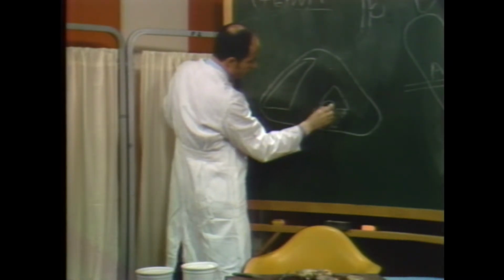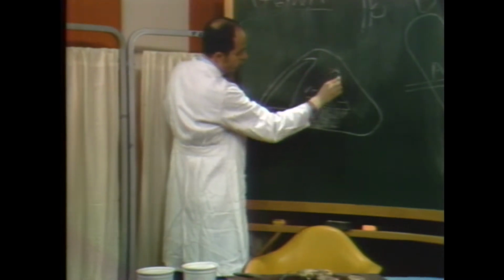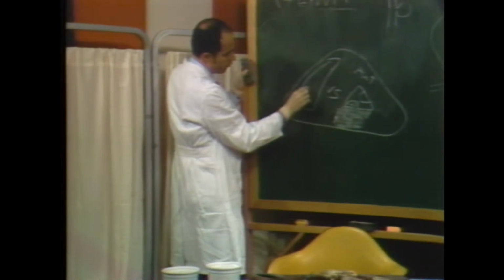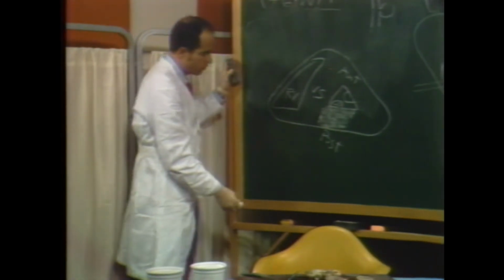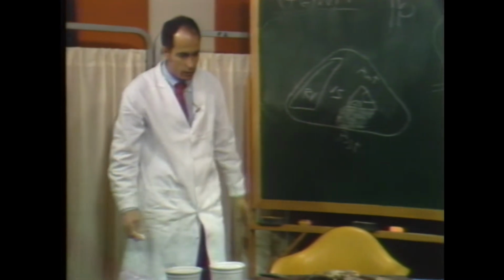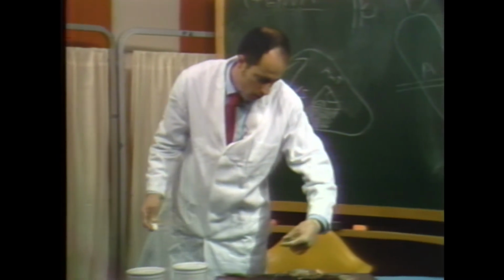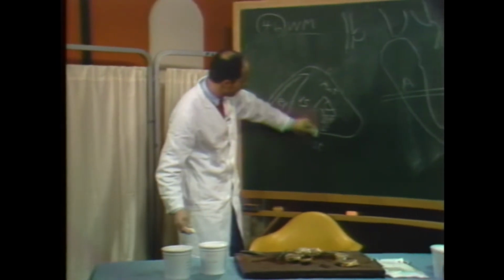This is the ventricular septum, anterior wall. This is RV, and this is posterior. That scar does not occupy a lot of the muscle mass of the LV, but it does actually protrude out some here.